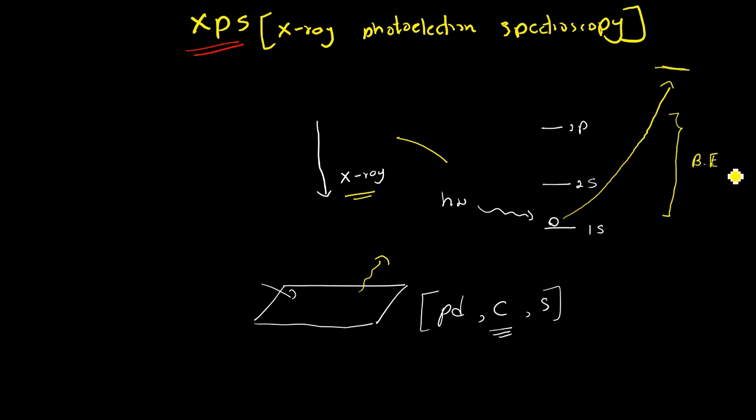This is the energy which we are going to supply to the electron, right? It has to use some amount of this energy to overcome the binding energy, and there will also be another very small energy we denote as psi. This energy is also reduced from our initial energy because there can be vibrations and those kinds of energy losses. The rest of the energy we can detect as kinetic energy, which we denote as K. Okay, so this is the process.